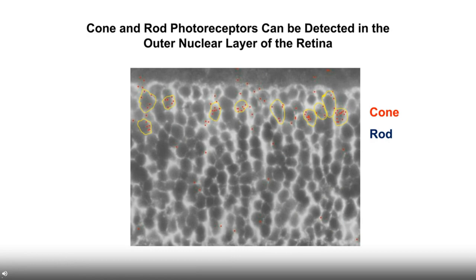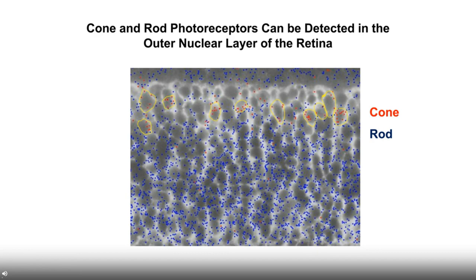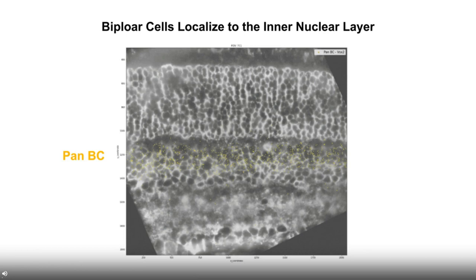Looking more closely at marker gene expression: in the outer nuclear layer, cells highlighted by yellow lines are cone cells because many cone-specific probes are highly expressed there. The probes against rod markers show all the remaining cells are rod cells. The cone cells are located at the top layer of the retina, which is exactly consistent with previous results.